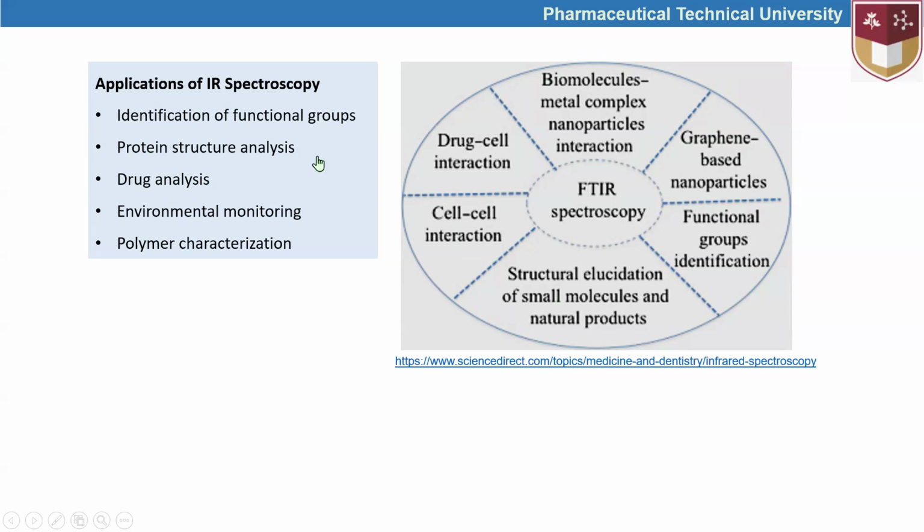IR spectroscopy can also be used for protein structure analysis, drug analysis, environmental monitoring, polymer characterization, and some other approaches can be developed by us.